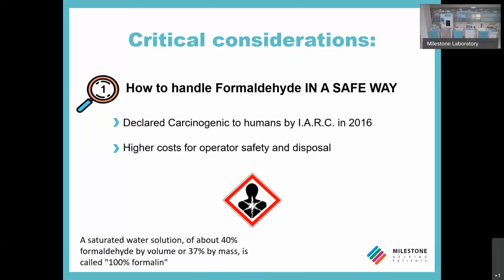for the histological diagnosis. Well, the first consideration is the formalin, because formaldehyde has been classified since 2016 by the International Agency for Research on Cancer as carcinogenic and mutagenic to humans. So formaldehyde or formalin, basically a saturated water solution of about 40% formaldehyde, is basically 100% formalin. Okay? So the reclassification of formaldehyde forces safety officers in hospitals, hospital administrations and laboratory managers to handle it in a different way, and therefore a higher cost for operator safety and disposal.